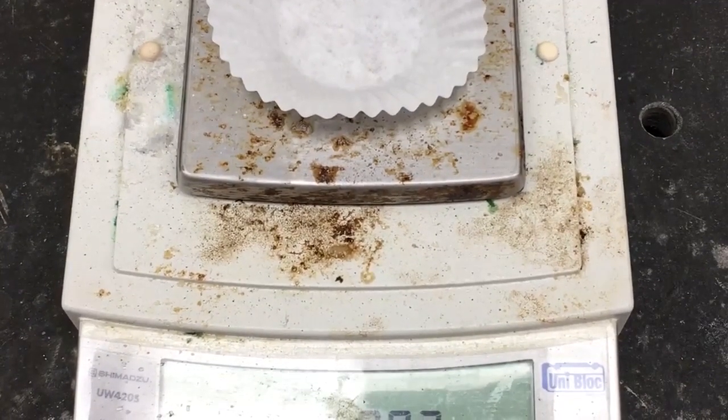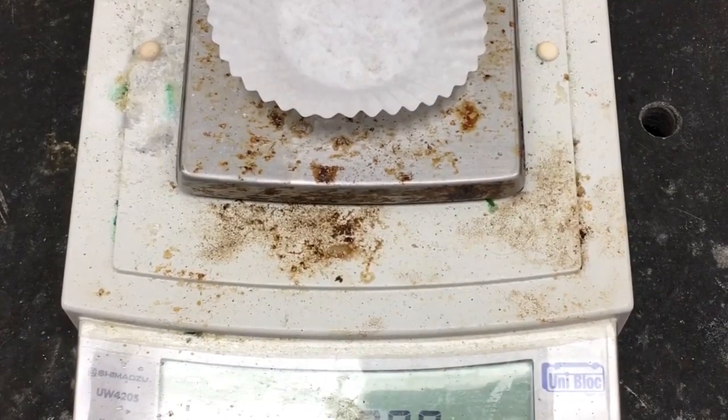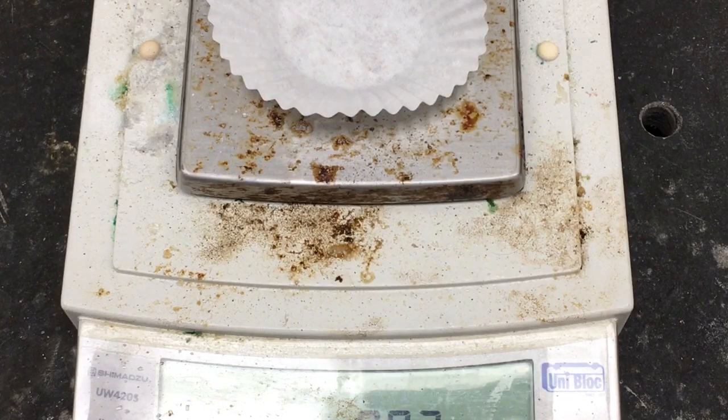You can see we're getting to the last significant digit that this scale is capable of, and so it itself has its own uncertainty. And you could account for that where you would have these as all your sig figs, but that is the uncertainty digit. So plus or minus 0.01 gram, or however we were going to do that.